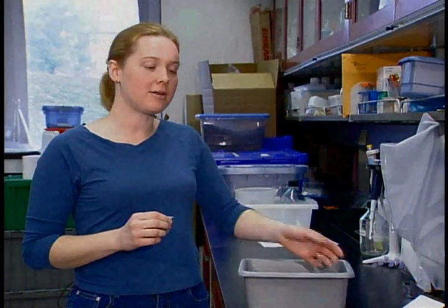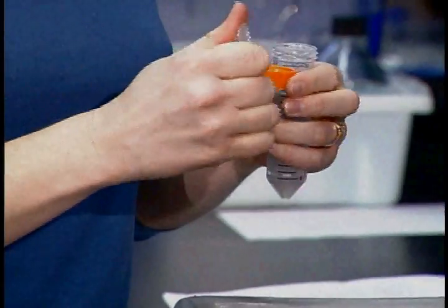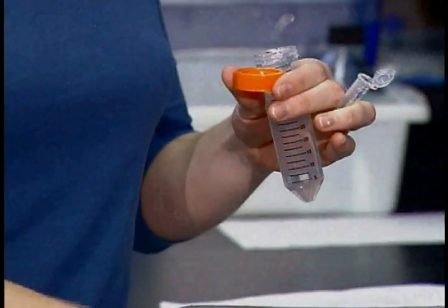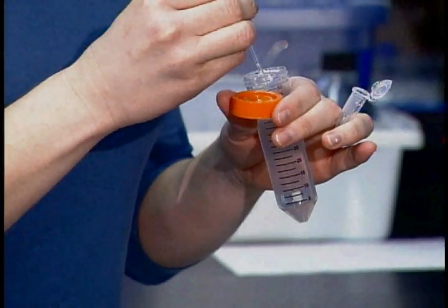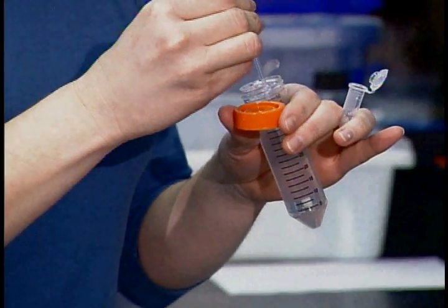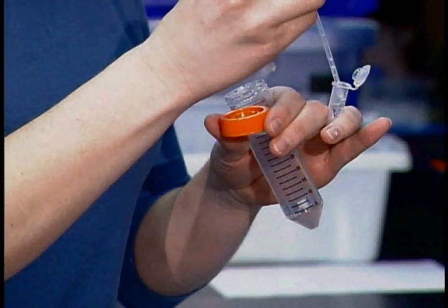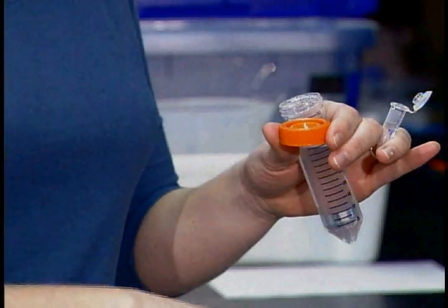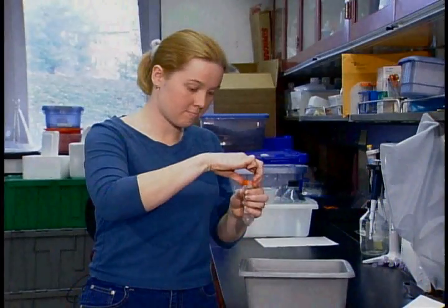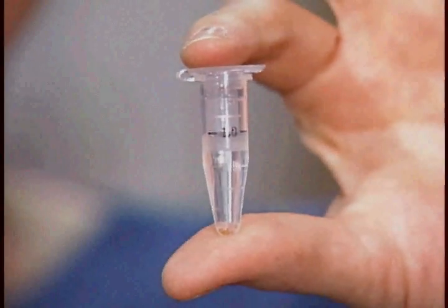Next, add about a milliliter of agarose solution to your tube. The agarose solution is a thin gel that will not only moisten the seeds, but will also spread them out and make them easier to plant. There's usually a one milliliter mark on the side of 1.5 milliliter tubes. Shake the tube well to disperse the seeds, then put it in the refrigerator for three to five days.